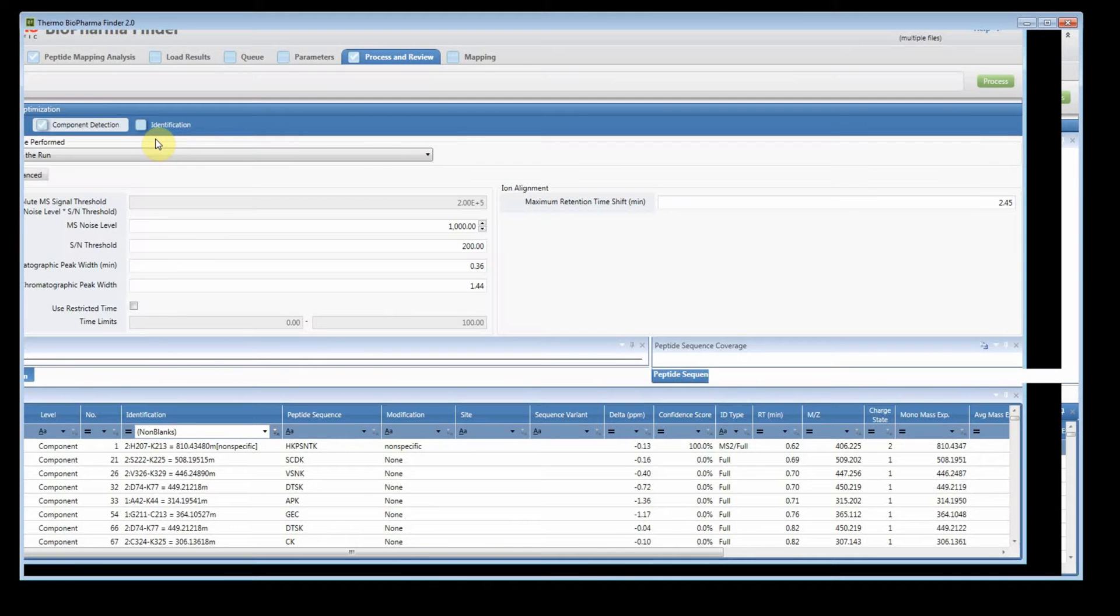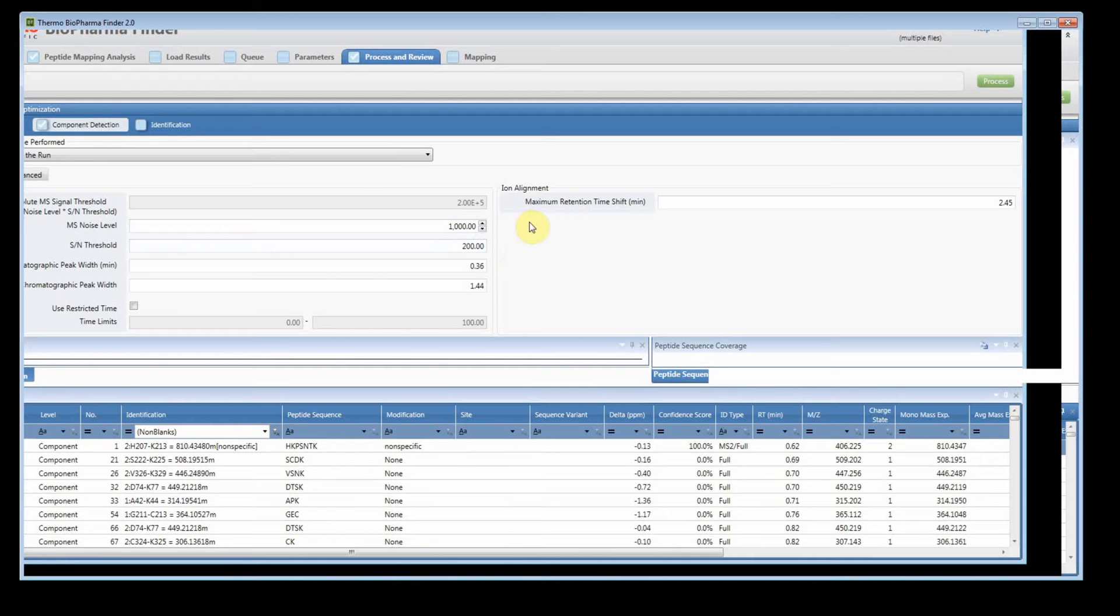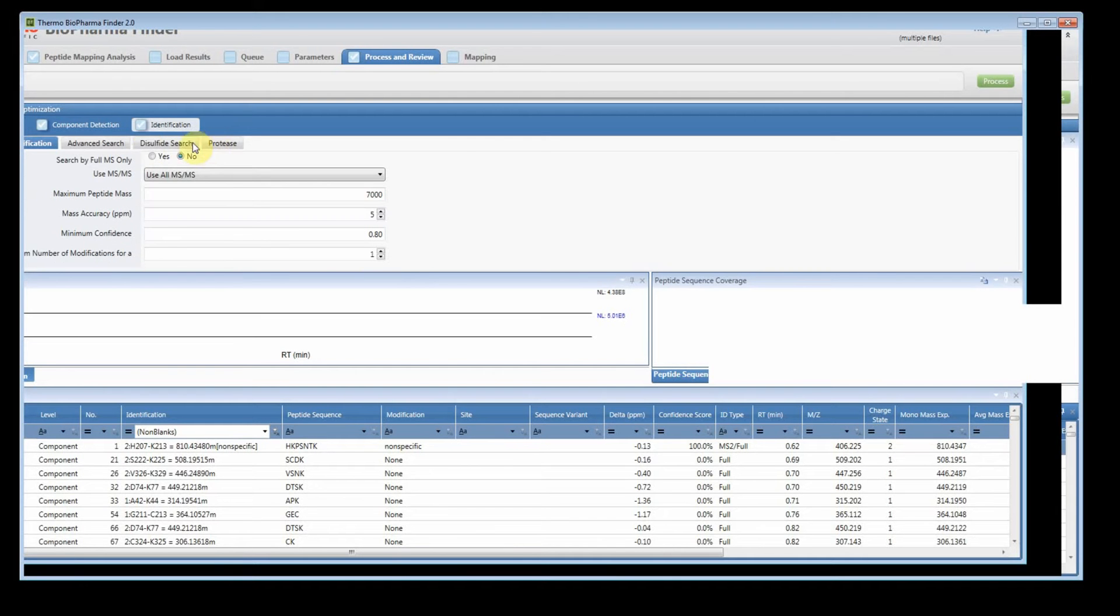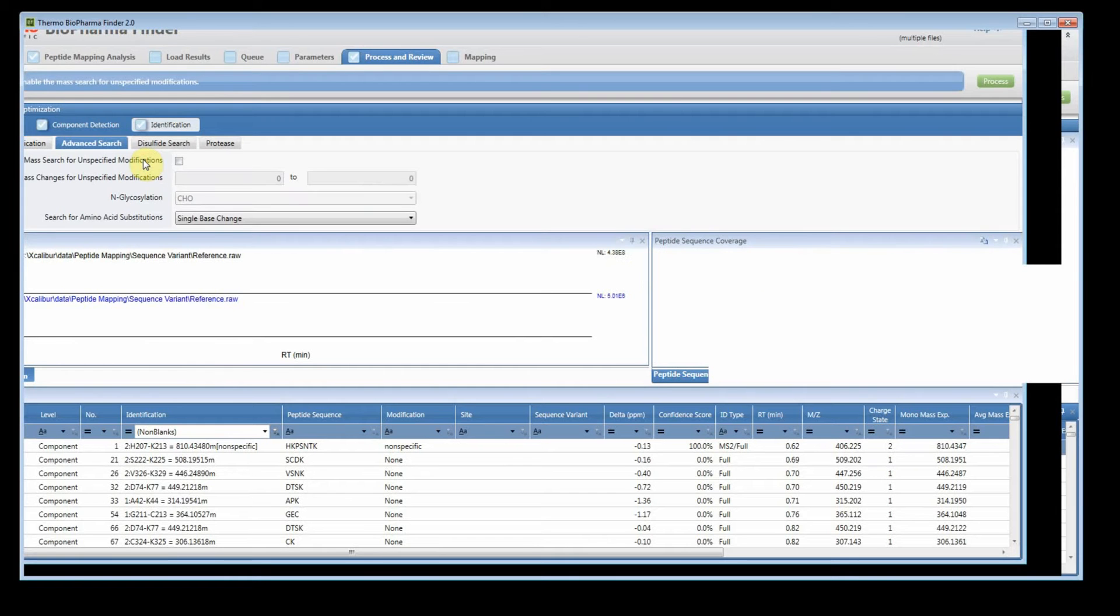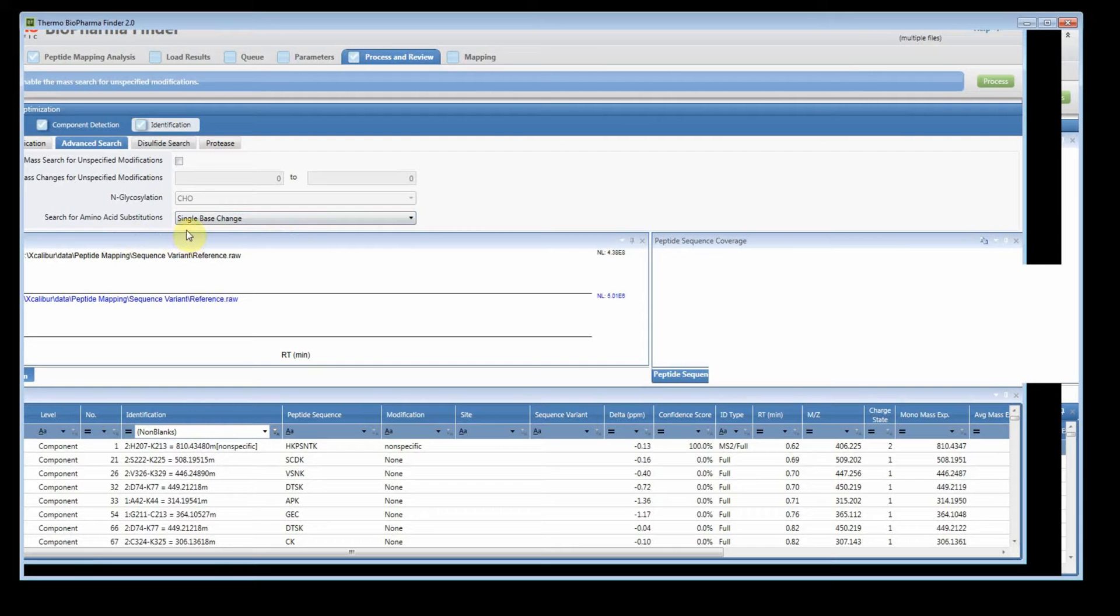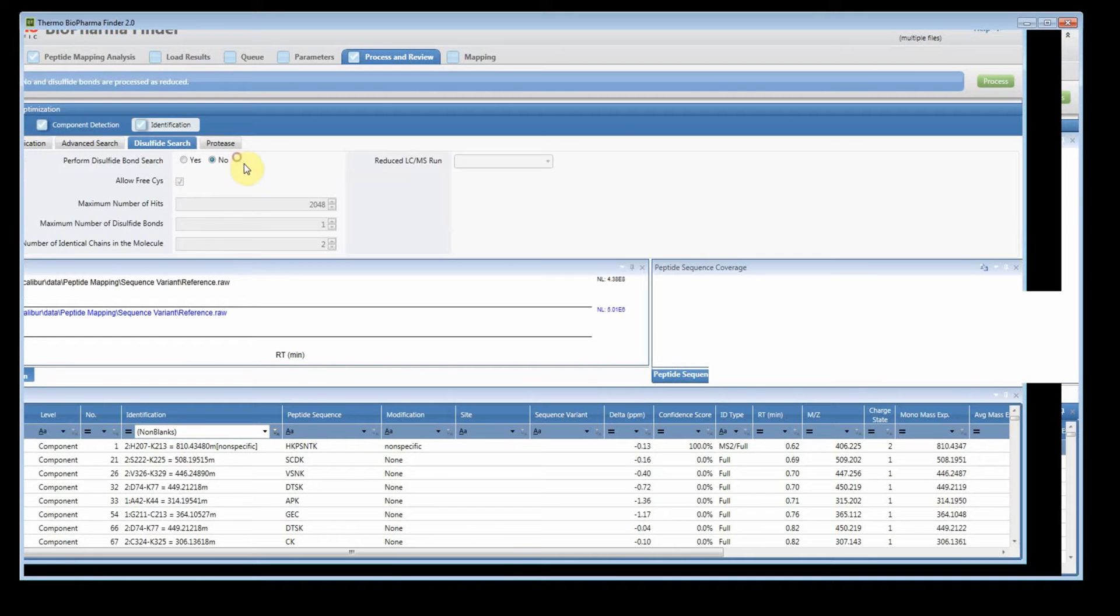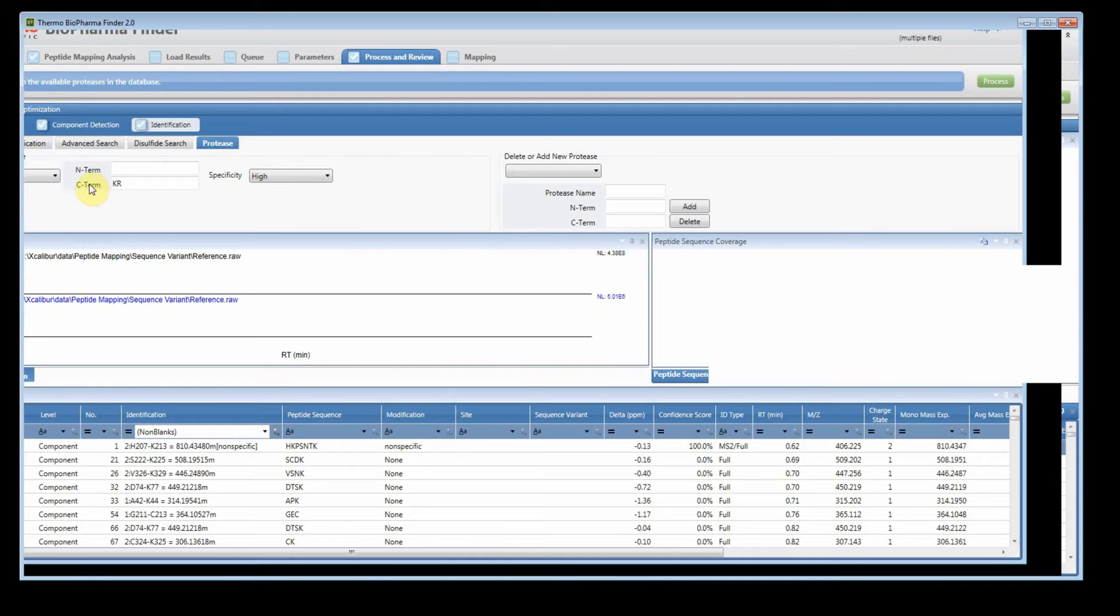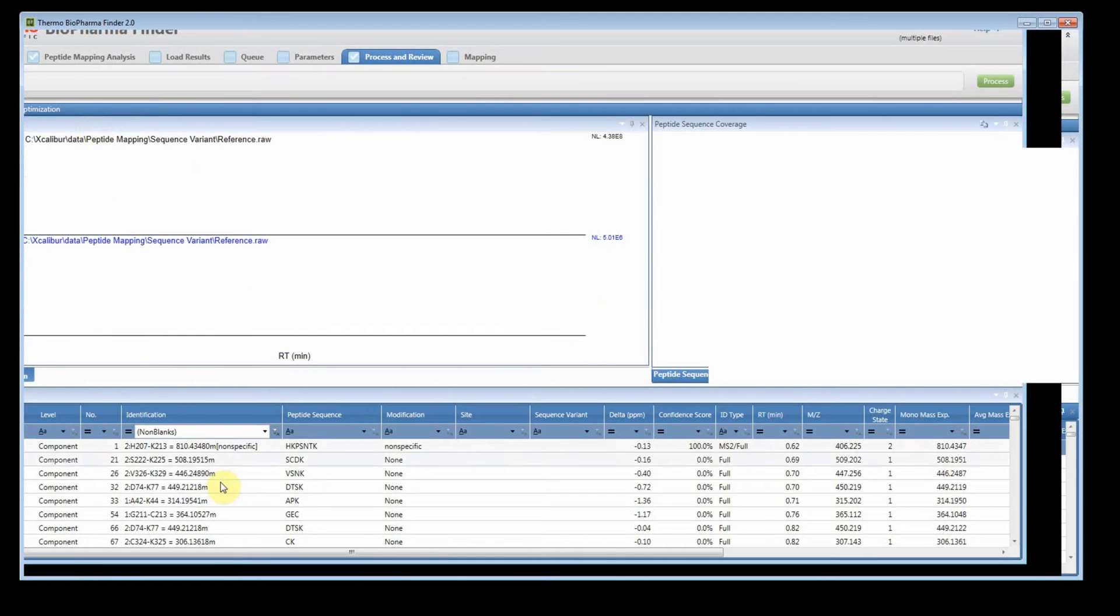For component detection I used basic parameters. I did raise the noise level and the threshold for the signal to noise a little bit to get us to about two even to five. And for the identification under basic settings you'll see I'm using the default settings here. I didn't change anything. Under the advance I am doing a single base change for the amino acid substitution. I turned off the unspecified modification search. No disulfide bonds and the protease is trypsin. So that's how I did the experiment.